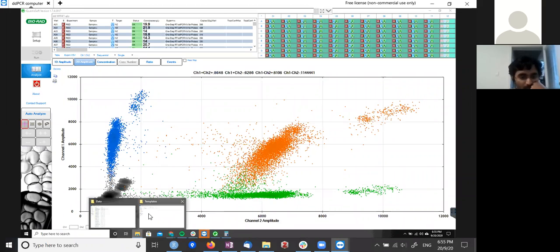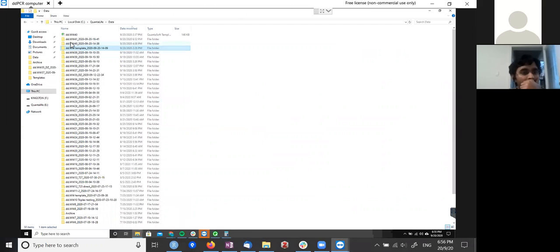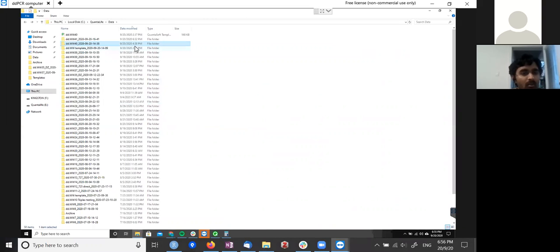So let's maybe close this file. I don't know who has done this. The last 2 ddPCRs have not been logged. They have been done today. Okay.